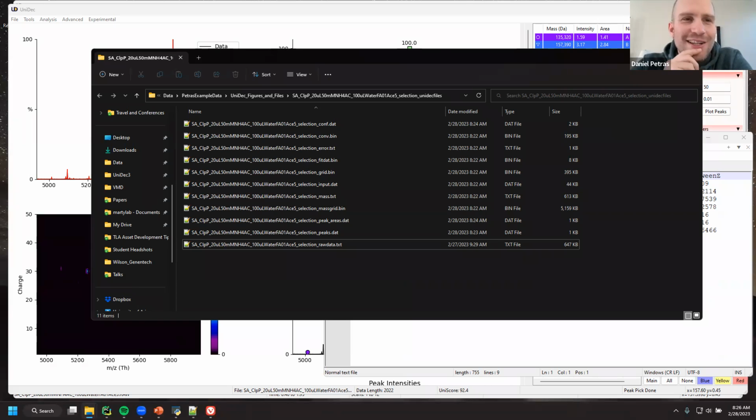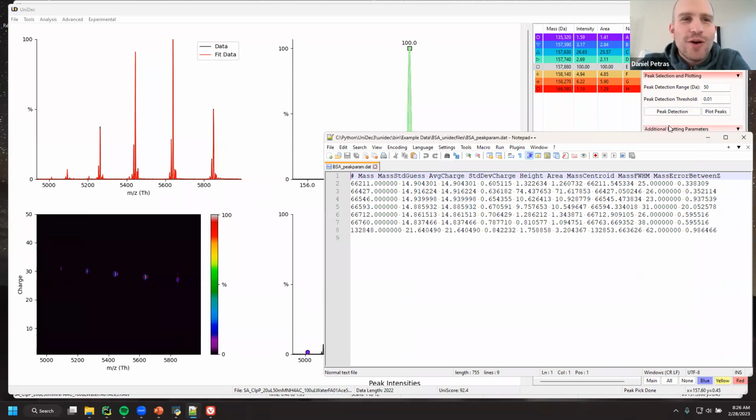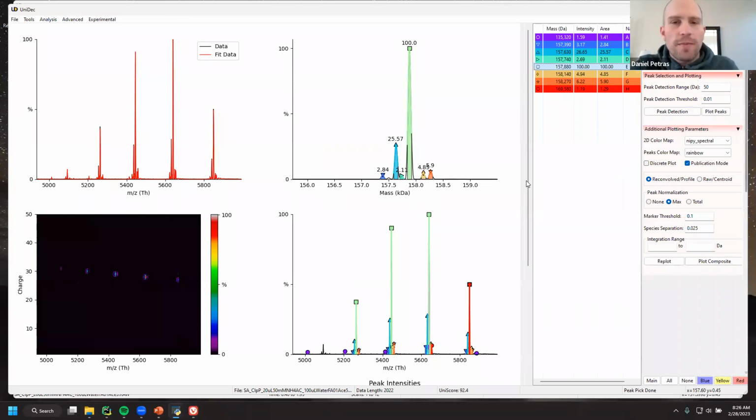Cool. Can I ask another question before you move on? It's very fundamental, at the beginning. So you dragged and dropped in the raw data, and I think I shared the profile mode data with you. Would it make a difference to use Centroid instead, especially with regards to efficiency? I think Centroid data would probably be fine. I think it's going to plot it as profile data though, so there could be issues with that.